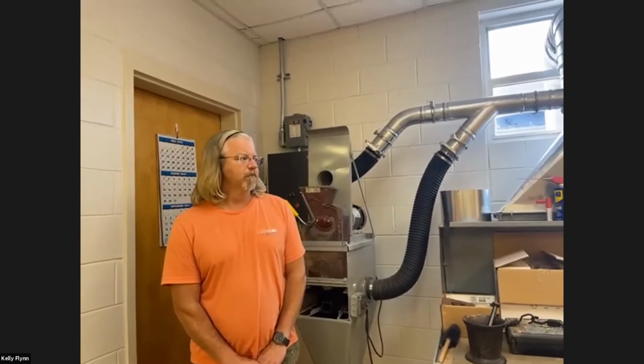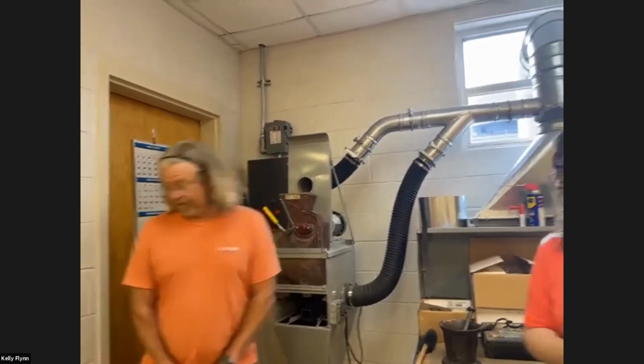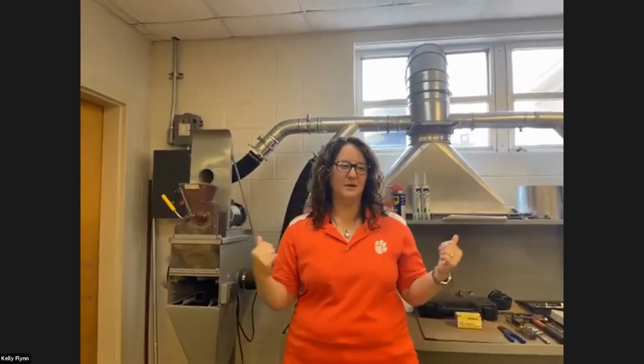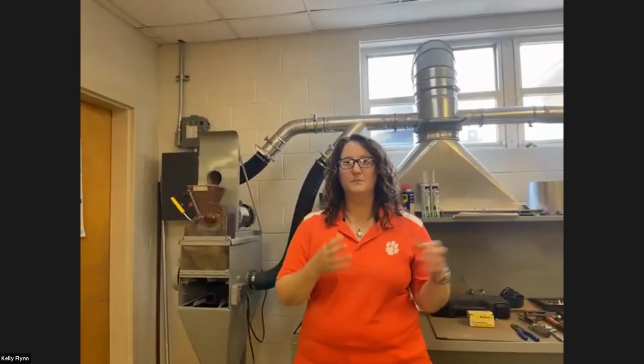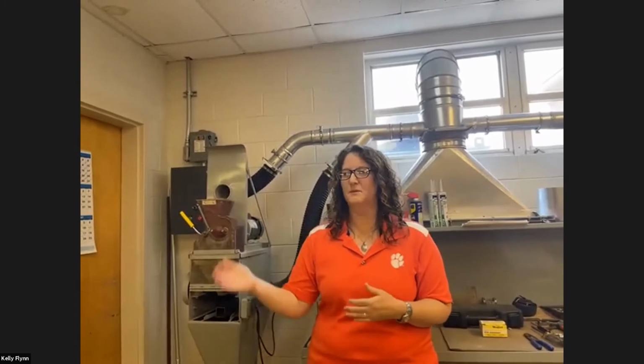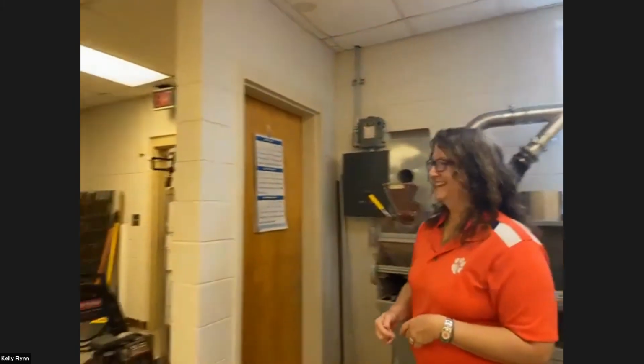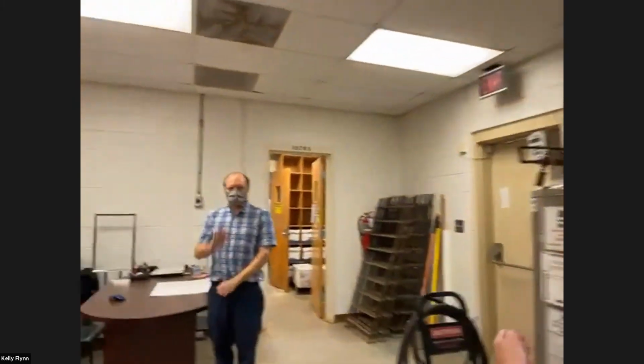All right. So after the soil, I'll step over here. After the soil is dried in the ovens that Michael showed you, and then in these 2 grinders, then we move the set, as he was referring to it, the 100 soil samples, into the laboratory section of the building. So this is really our kind of pre-prep area for our soil samples, and then we move on to where we start doing some chemistry with the samples. So we'll go ahead and walk that way. It's one of our other chemists here, Sam.